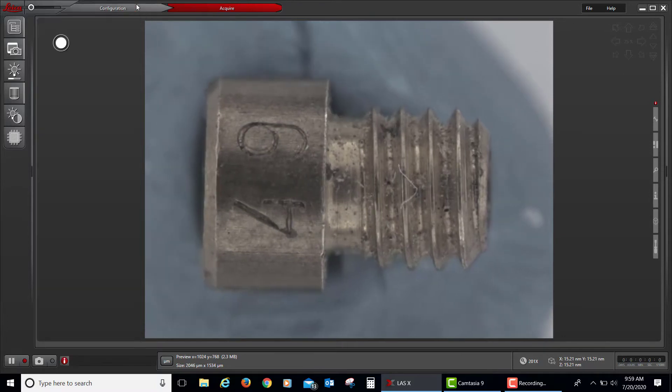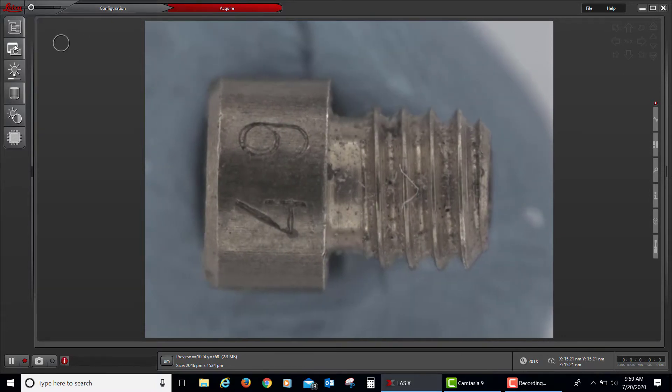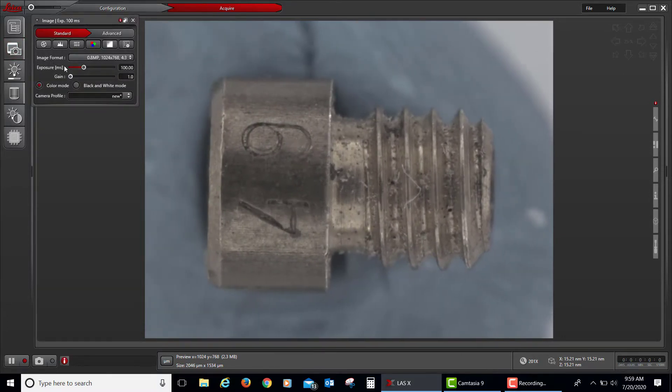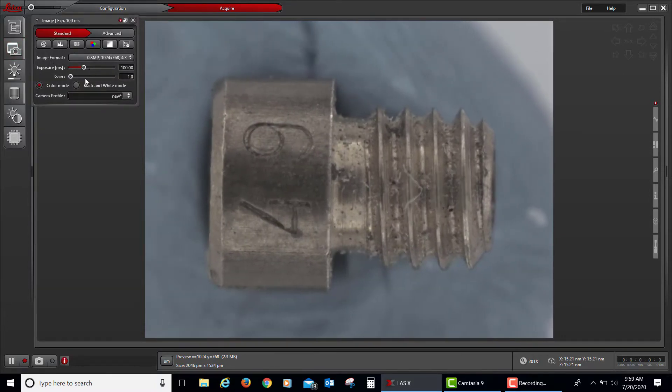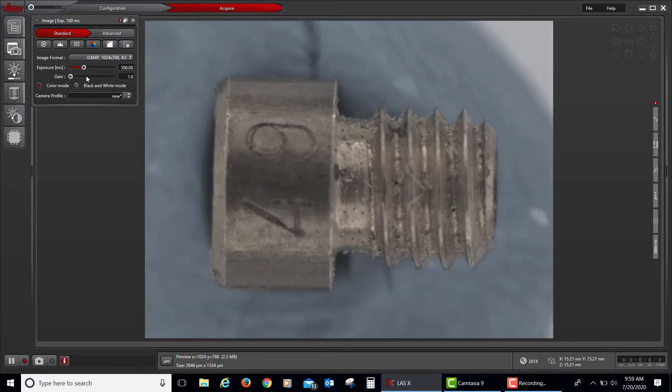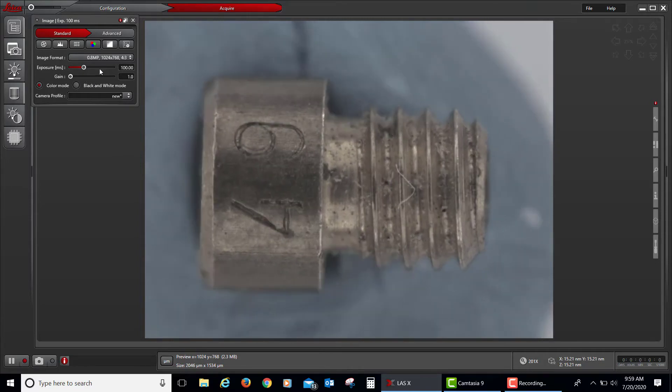3, and so forth. Below that is the tool to adjust the exposure time, increase or decrease the gain, and other controls for your camera.